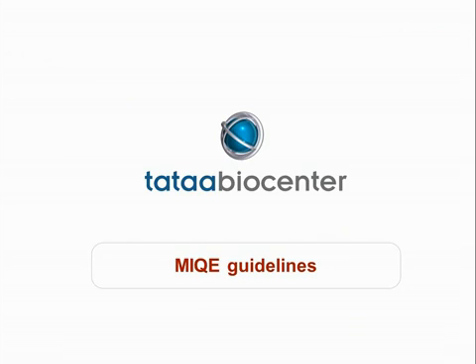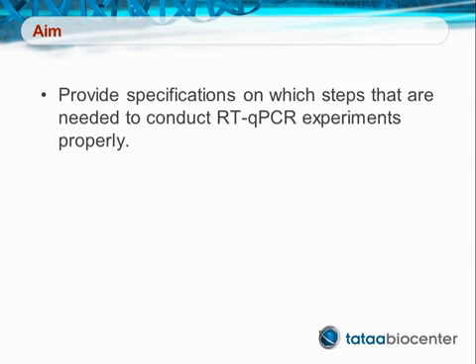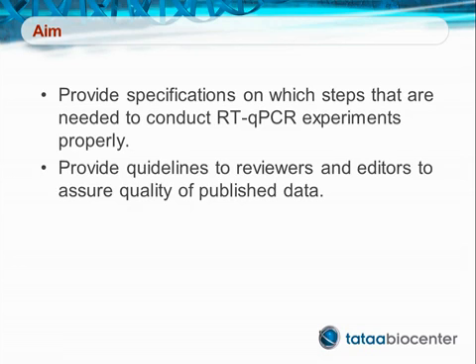Finally, we will talk about the MIQE guidelines. So what is the purpose of these guidelines? Well, the aim is to provide specification on which steps are needed to conduct RT-qPCR experiments properly, and also to provide guidelines to reviewers and editors to assure quality of published data.